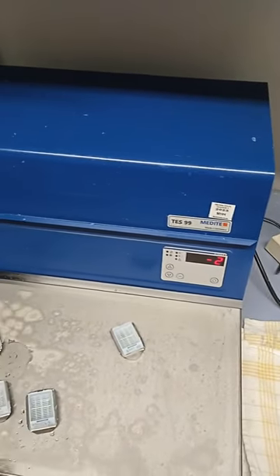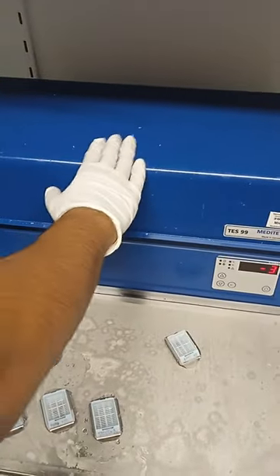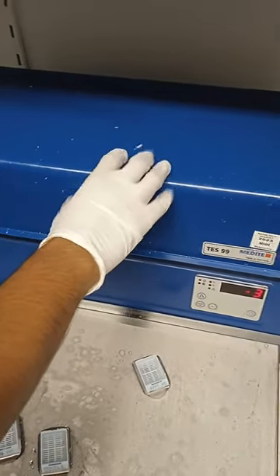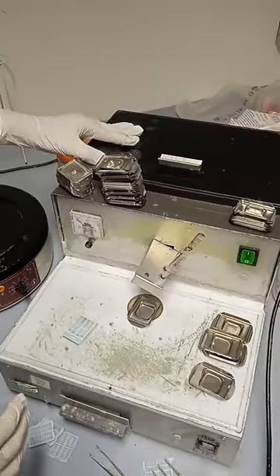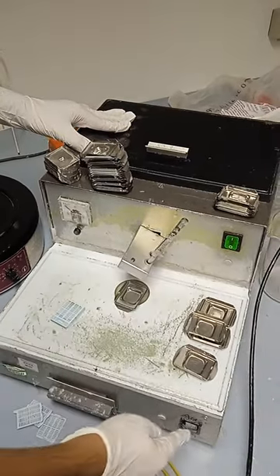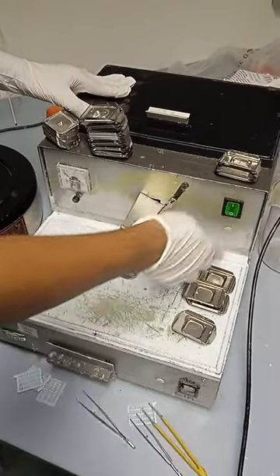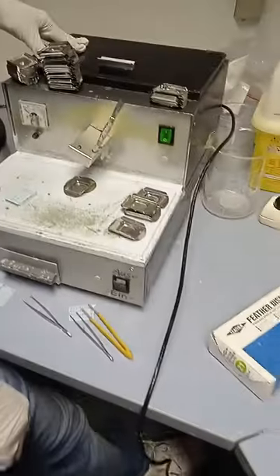Hello everyone, today I'm going to show you how to paraffin embed your tissue. The first machine we have to turn on is the cooling machine. The other machine we need has paraffin inside — it's already turned on. There are two switches here, already turned on, and from here the liquid paraffin will come.